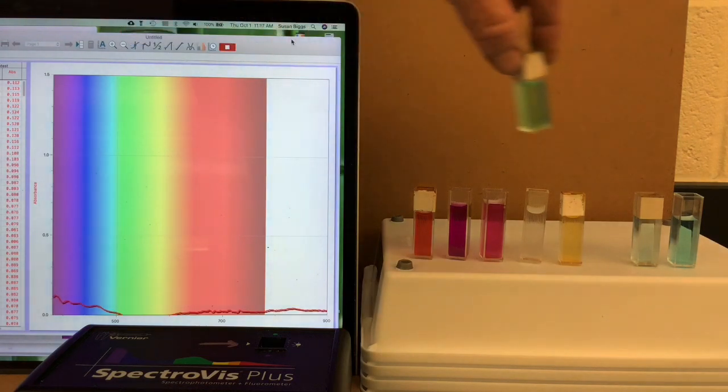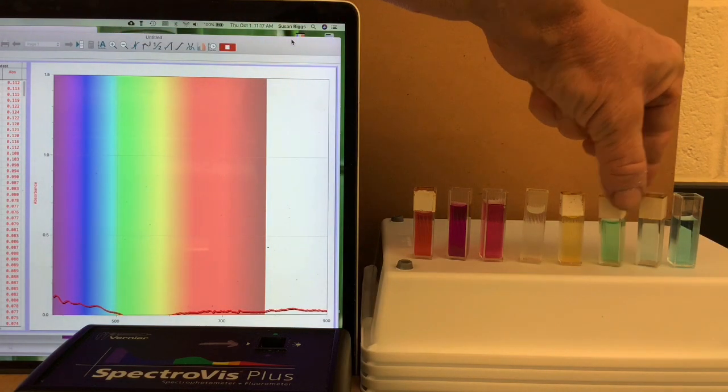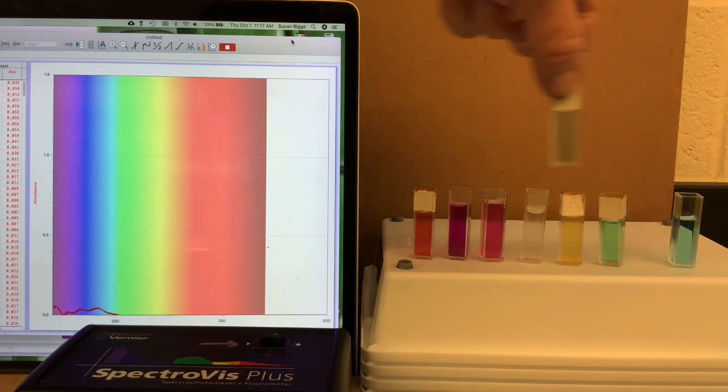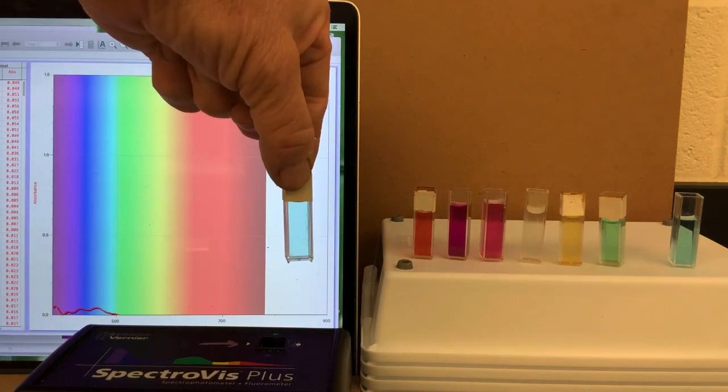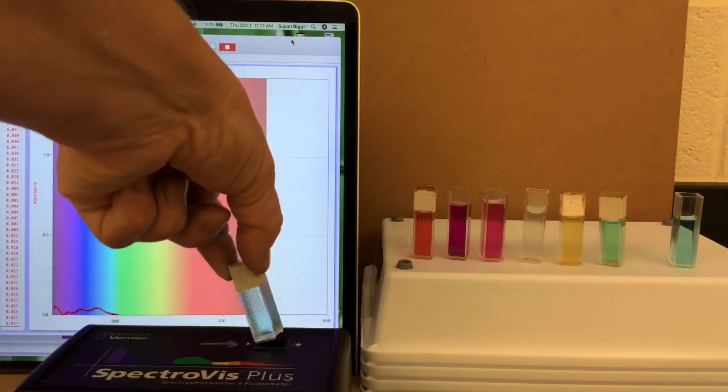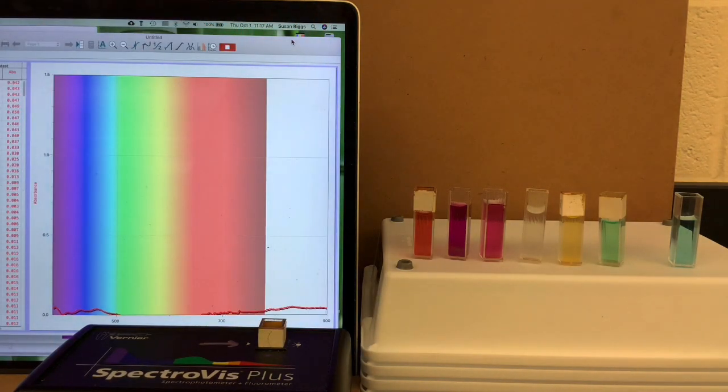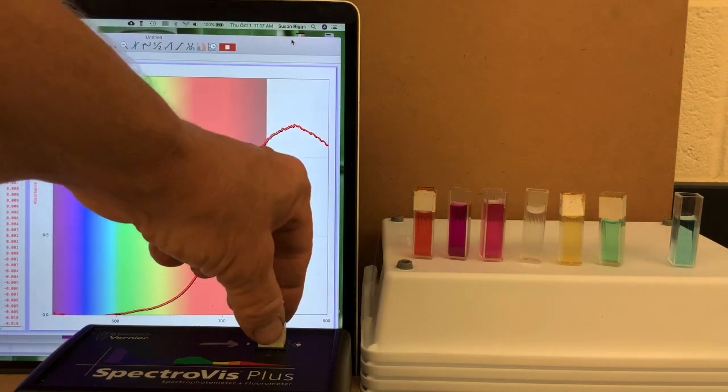And lastly, we'll take a look at two copper solutions, a less concentrated copper. Copper ions are blue. Notice that it absorbs strongly in the red region.